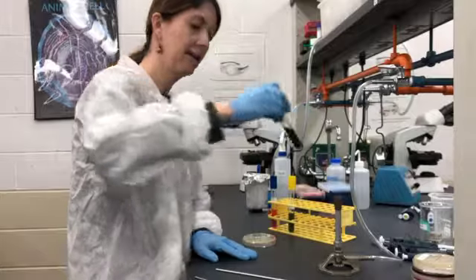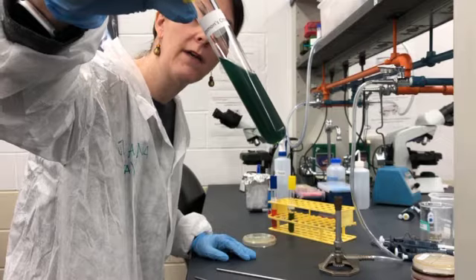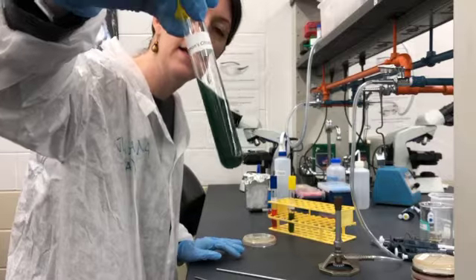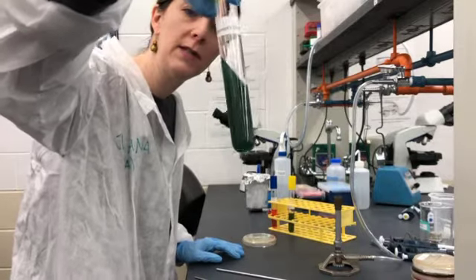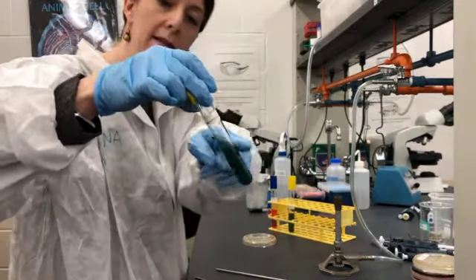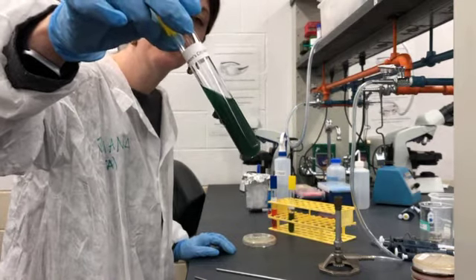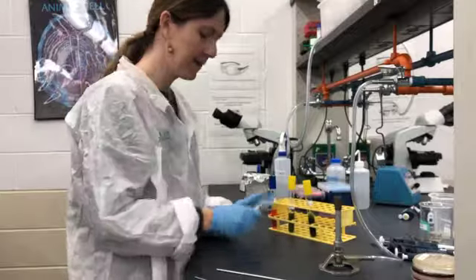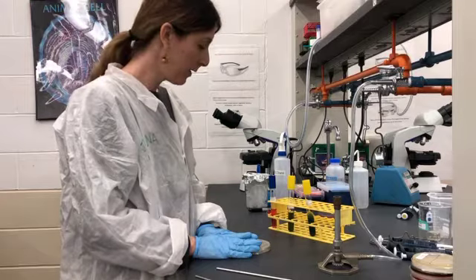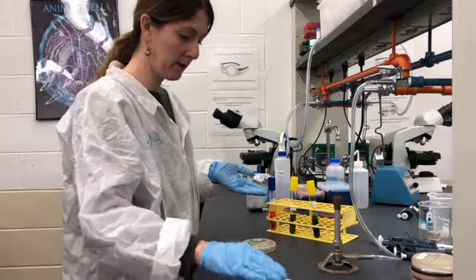And lastly, this is called a slant. A slant has the same amount of agar as you will find in the plate. So if you touch it, it will have that bouncy resistance. But when the media is put into the tube, we let it cool at an angle. And that will create this broader surface that we can use to inoculate our bacterium. So this is a slant. And then you guys know and love the plate. So let's go through how we'll inoculate these different types of media that have various amounts of agar in them.